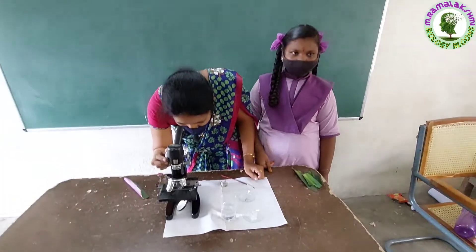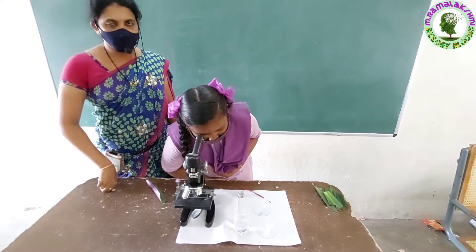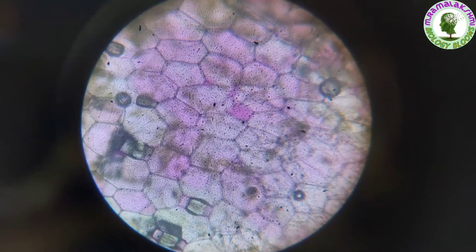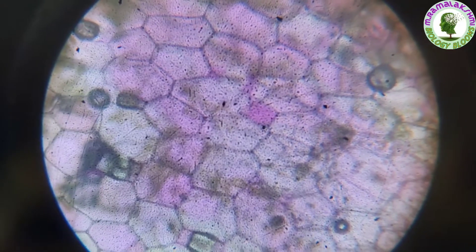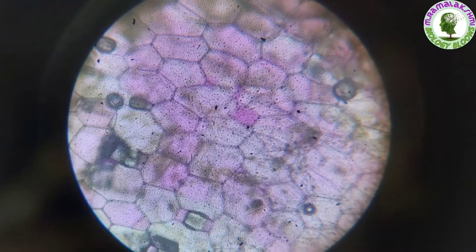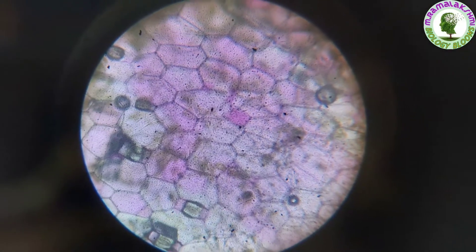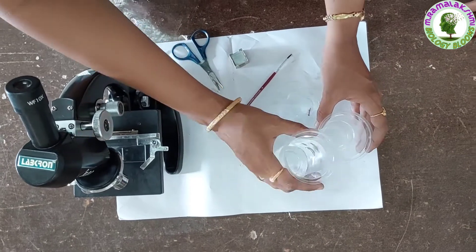Now observe it. I am observing rectangular to polygonal shaped cells, ma'am. Some cells appear in purple color, ma'am. Yes, they are purple because of anthocyanins.